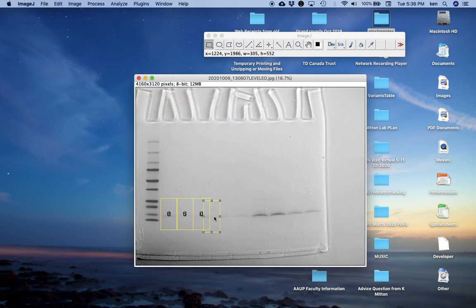Now you've seen that, what I will do is I'll speed this up a little bit, and I'll use the command number 2 on my keyboard to just keep doing the selection of the next lane. So I click, hold, and drag off the number, command 2, select the next lane. Select the next lane again, and again, and so on.